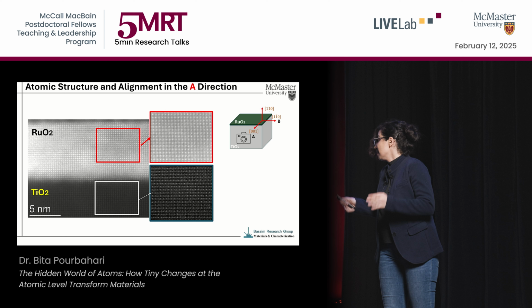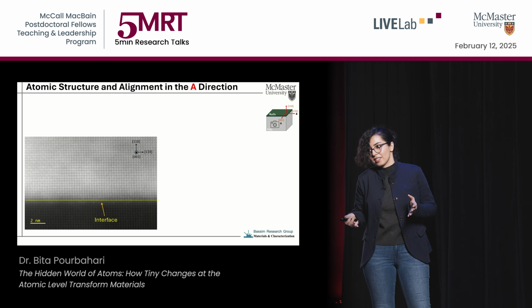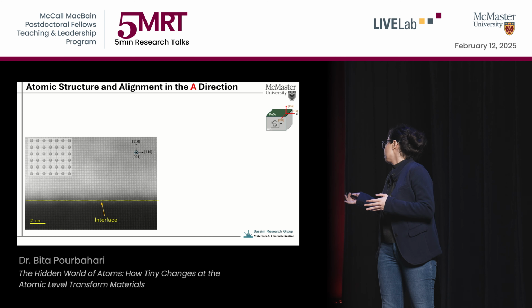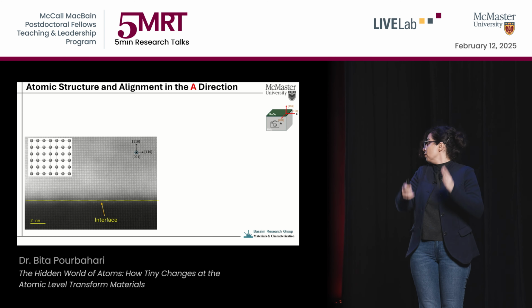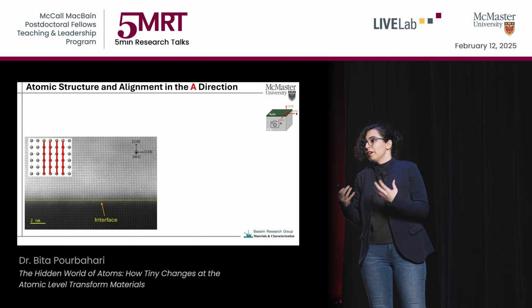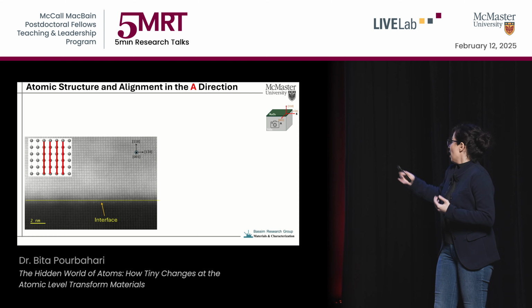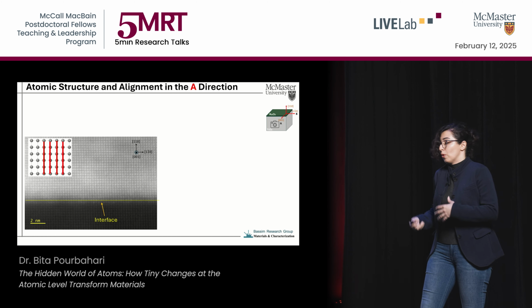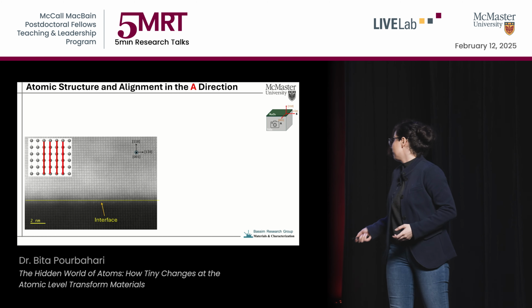In materials science, when we have something like that, we have a perfect position of the atoms in one line, something you can see here. We call it a perfect crystal structure. To make my life easier, I changed the mode of this picture to the FFT mode, like changing TIFF mode to JPEG on your phone.